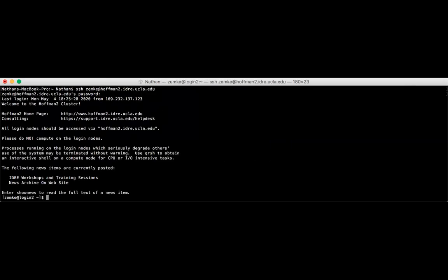Now we are going to request an interactive session with the following command. And again, if you want to reference the slides, this is on slide 34. Except instead of 2 hours, we're going to request 3 hours because we're starting earlier today.